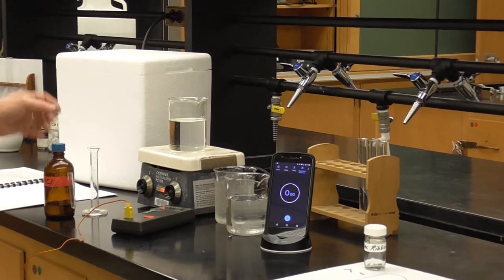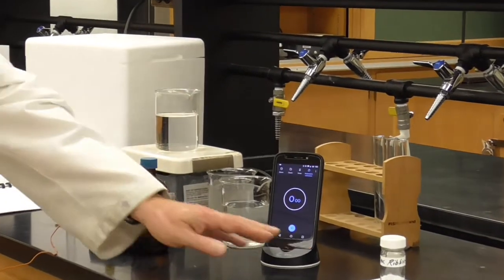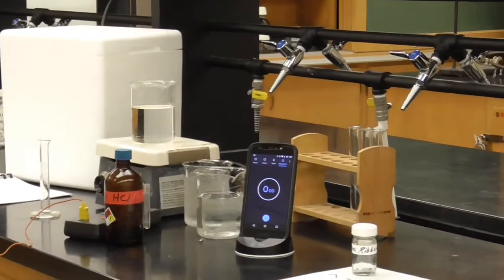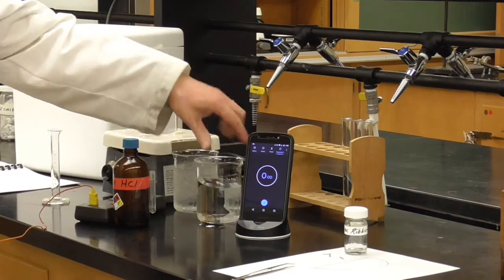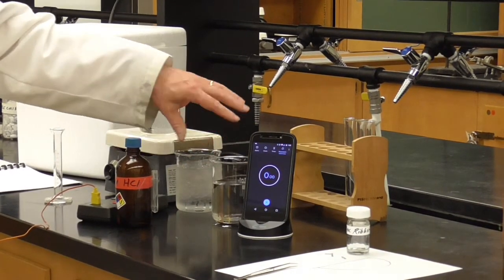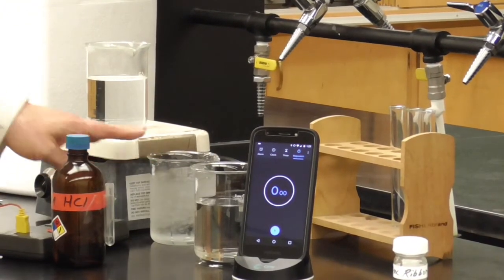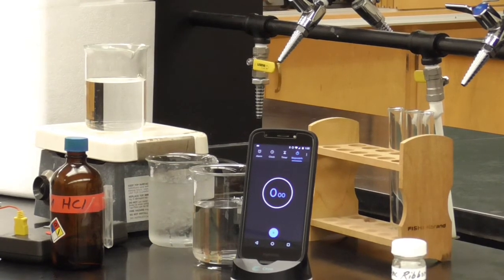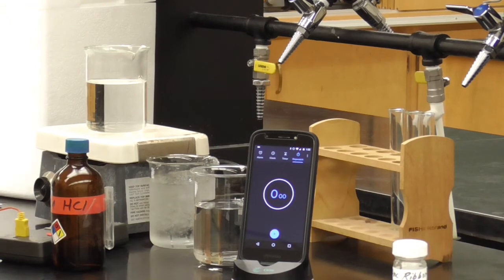We've got, once again, the 6 molar hydrochloric acid in zinc strips. So we've seen that reaction already before. It produces the hydrogen gas and it bubbles. But we're going to do it in different water baths. We have one beaker here where it's just room temperature water, and we'll put our test tube down in that and kind of keeps it at room temperature. We've got this one where it's going to be an ice bath. We've got this one up here where it's going to be at about 40 to 50, maybe 60, a hotter one. We'll say about 50 degrees.